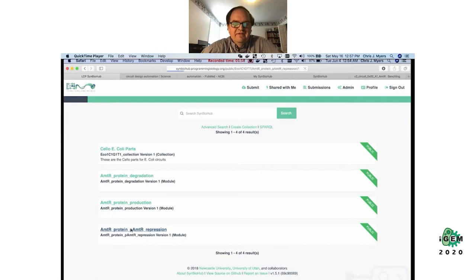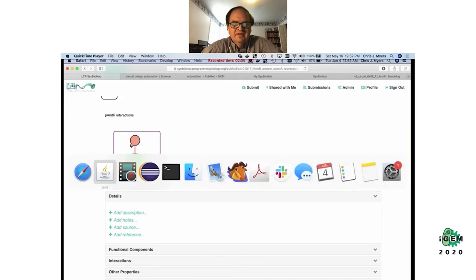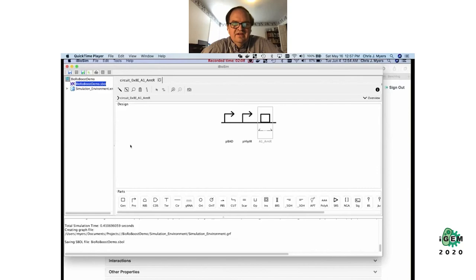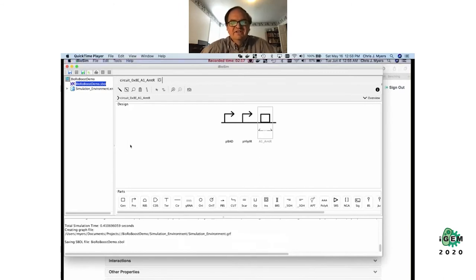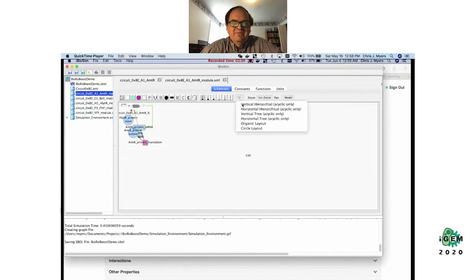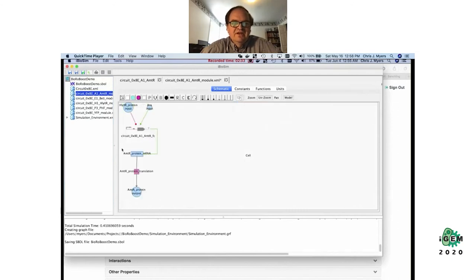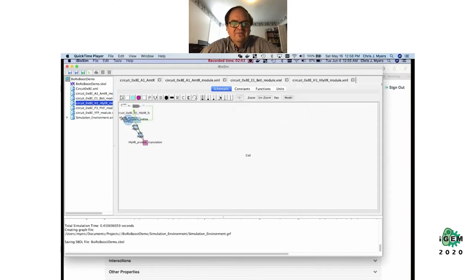When looking at a part you can see where it was used and what interactions it has — for example, this coding sequence codes for the AmtR protein, which is used to repress the AmtR promoter. The tool is mining all that information to build a computational model, finding all of the various interactions and parameters and building a biochemical model composed of species and chemical reactions. Here's an example of one circuit in the model: a transcriptional unit repressed by a protein and activated by a small molecule.